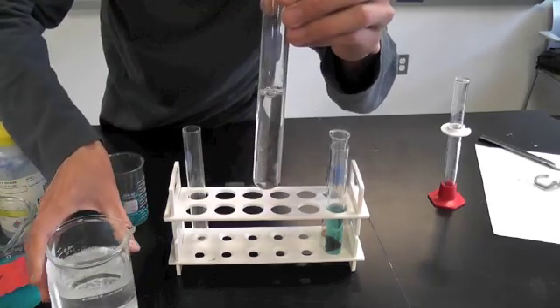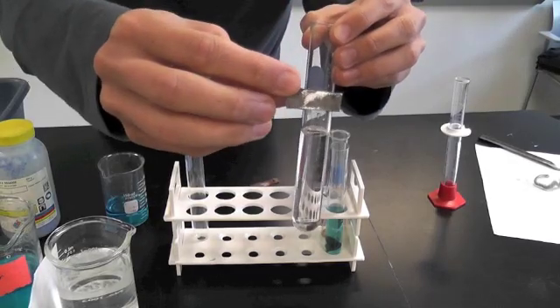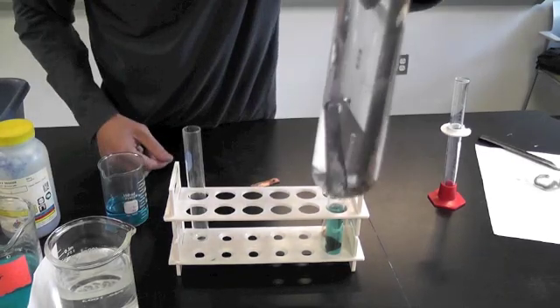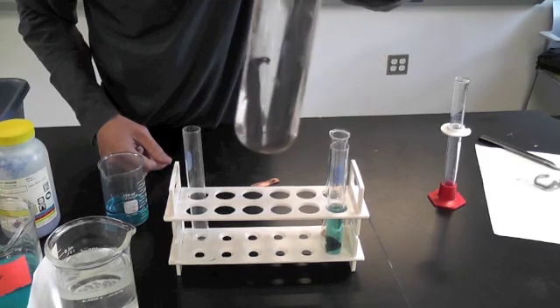Simply pour it in, drop the piece of zinc right in, and you don't have to mix it. The reaction should start right away — it just takes a little bit of time.